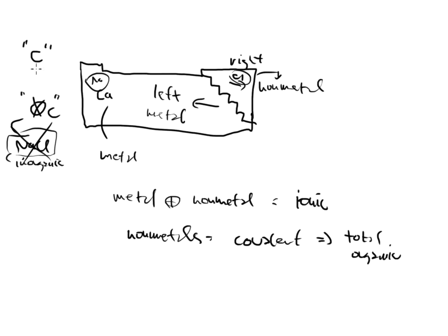Now let's take another compound, and let's make sure that this compound does have carbon. Let's pick out something, say C6H12O6. Let's say that compound is inside of a sample, and I submit that sample to my TOC instrument. If I look, my carbon is over on the right-hand side, and there's carbon here, so that's a good sign that TOC could see it.